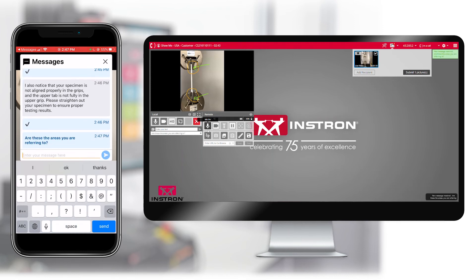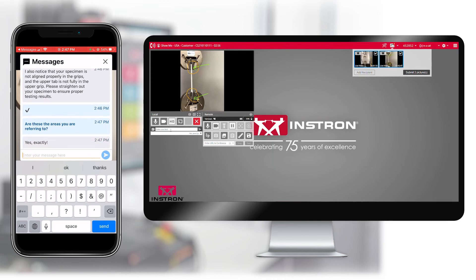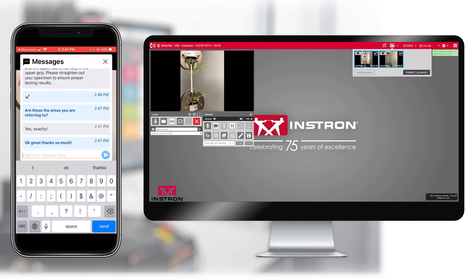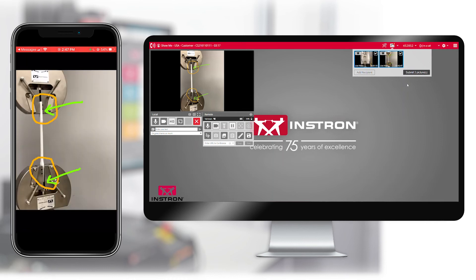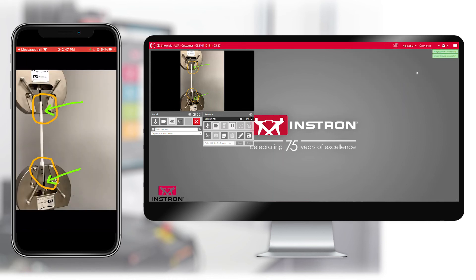Technical support confirms that the correct areas are indicated via chat and saves the second picture as well. The technical support engineer confirms that the customer has no further questions and that the remainder of the setup looks correct. The pictures are submitted to be included with the technical support call and a copy is also sent to the customer for reference.